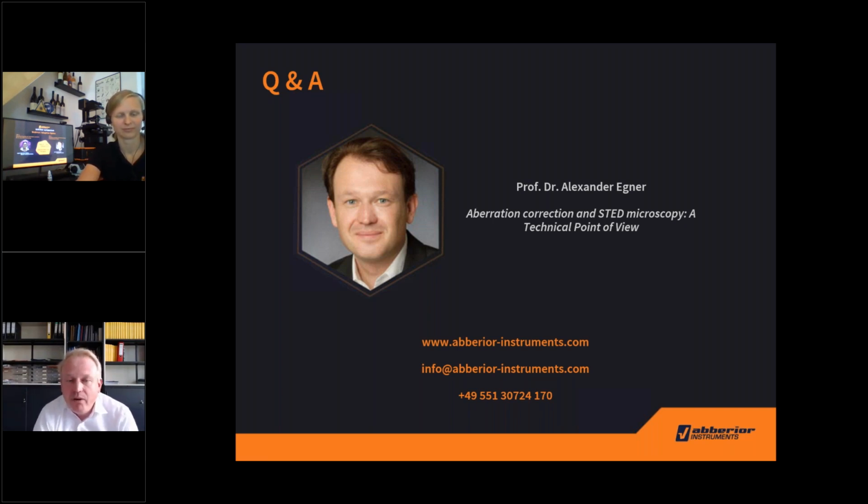But maybe one thing I have to mention is, of course, we are just wiggling a bit. So actually, the aberration correction is also on for the rest of the frame, and it would also adapt if things change over time. So actually, it's a bit faster when we are close to optimum conditions. But anyhow, we have to go at least 3 times through every order of aberration.